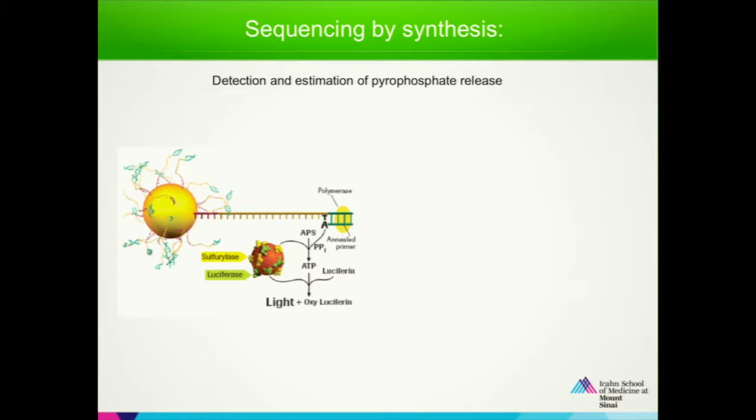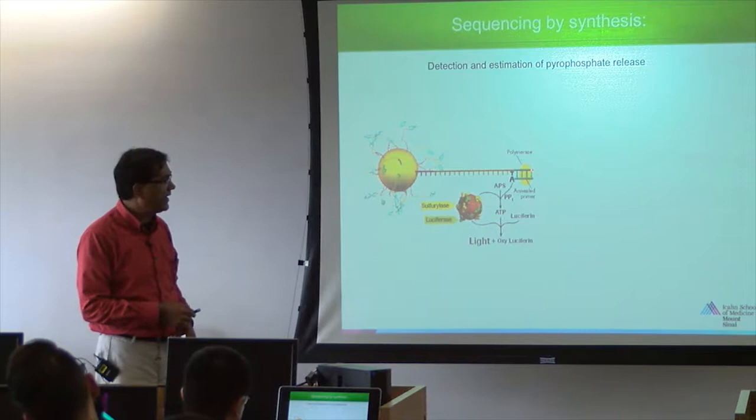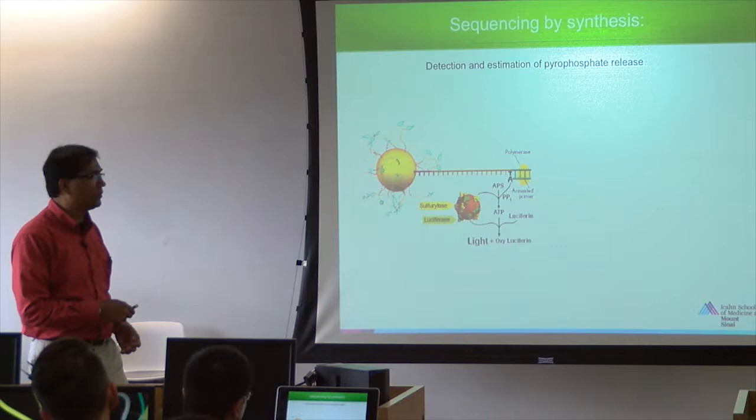So basically what was done is that you take a bead again. In that bead, you have the synthetic oligonucleotides. You have to go back to that concept which I told you, in the 1990s, '91, '92, when differential display was developed, they developed the concept of adding synthetic adapters to the DNA. The same concept was repeated here. They broke the DNA into small pieces, added the synthetic adapters, and then the complementary of those adapters were on that particular small bead, okay? And when you put that adapter to the DNA, you can stick it to the bead.